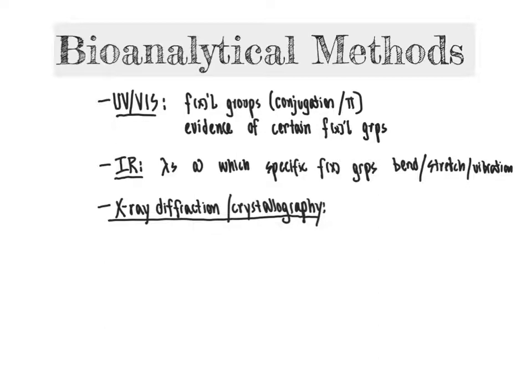So X-ray diffraction and crystallography is going to use X-ray diffraction patterns to determine regions of electron density within a molecule.